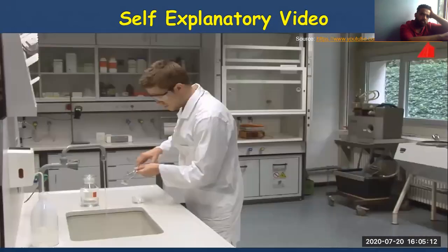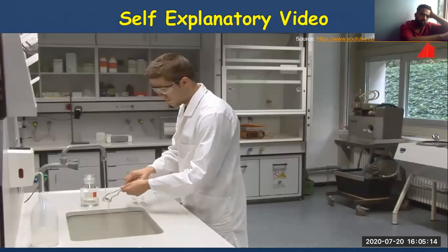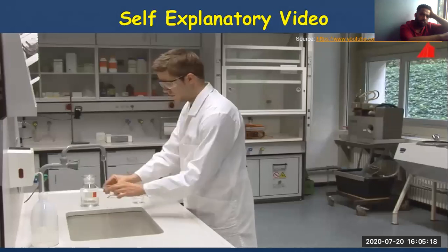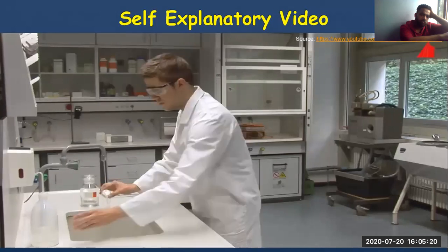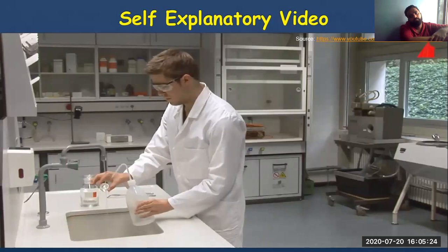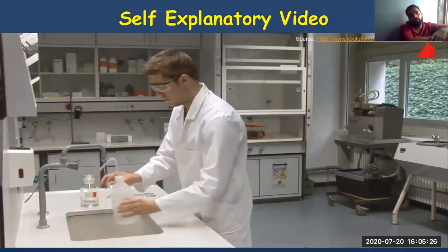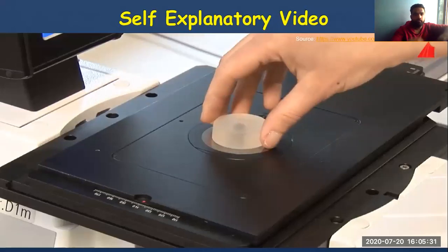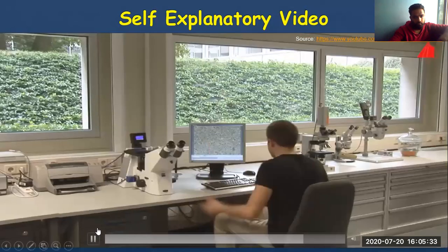Then he rinses the microsection thoroughly with water and afterwards with alcohol. The hairdryer is again used for drying. The excitement increases. Was the etching time correct? Has everything worked out fine?